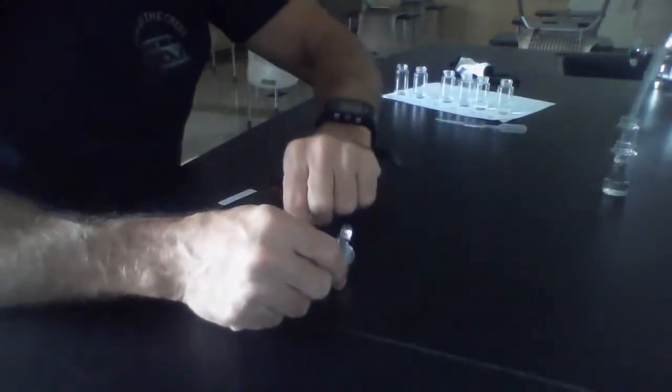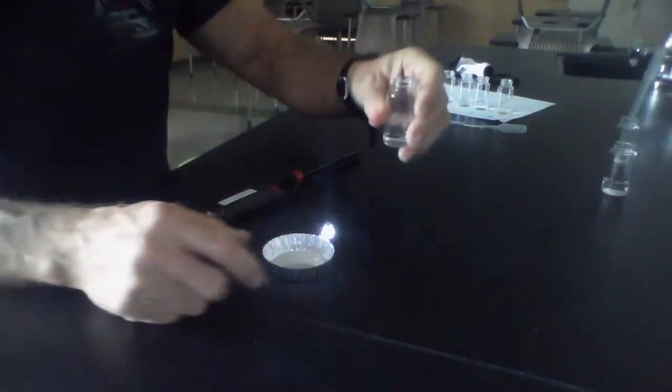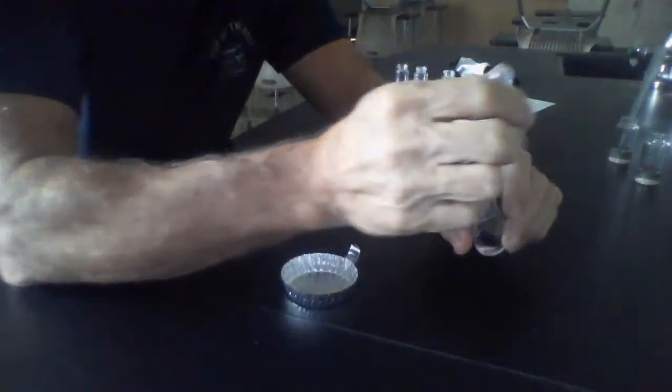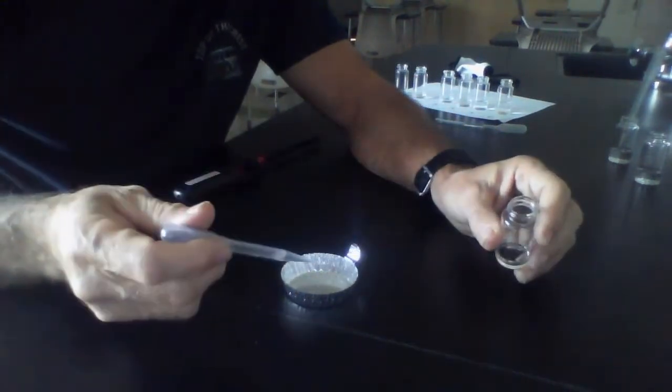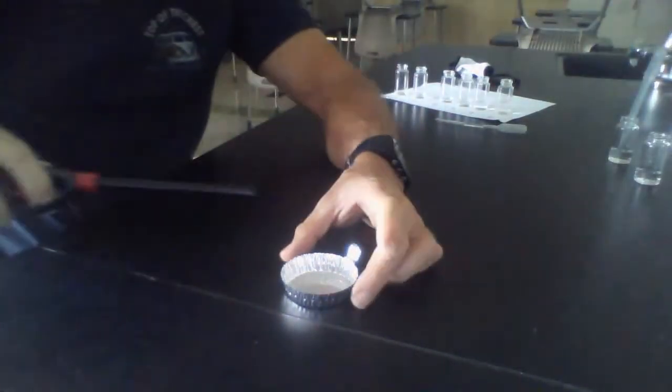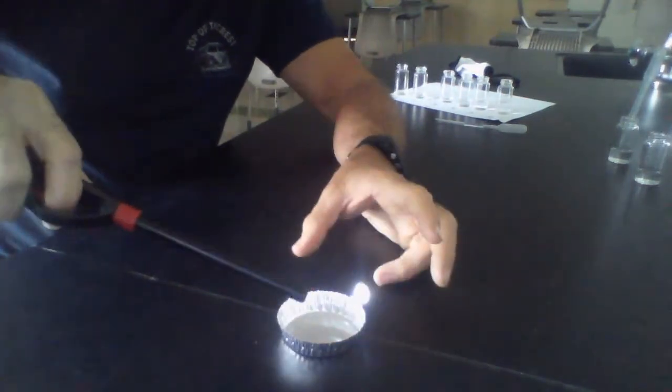Now it's time for isopropanol. Making sure we're safe, moving everything far away. We're in position. Okay. 1, 2, 3, 4, 5. Everything far away. 3, 2, 1, and ignite.